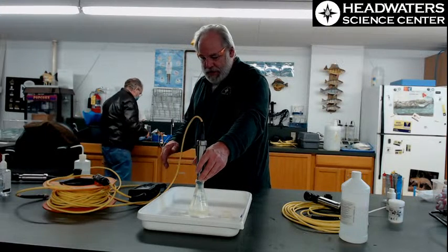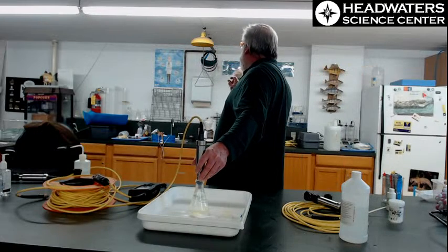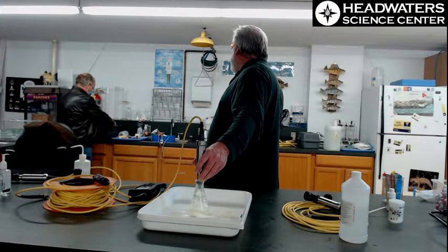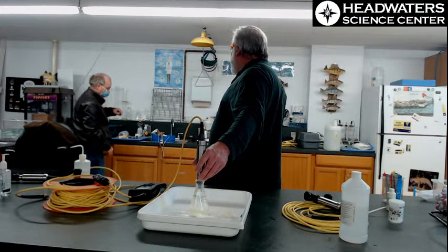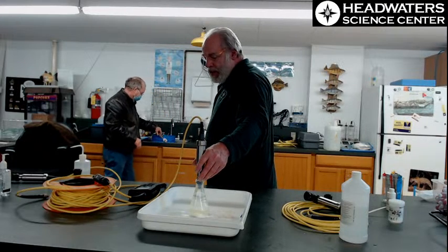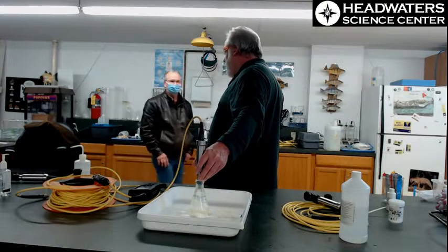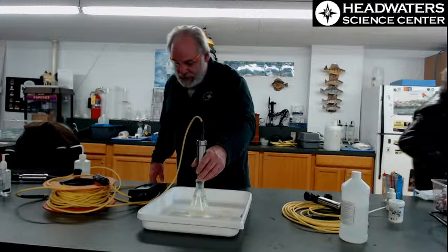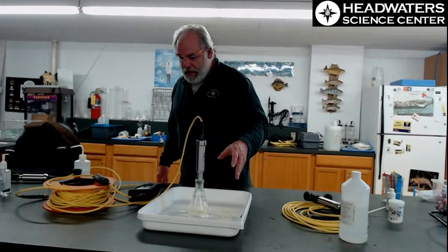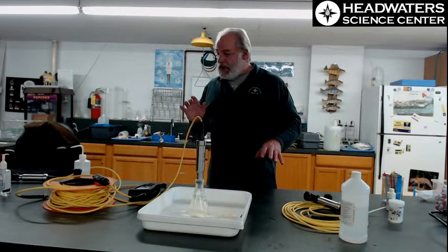Now this thing is really being stubborn about finding its calibration, so I've got more to say. We have to make sure that the sampler itself doesn't bring anything in. I clean up the box. Right now I'm soaking the rope. I make sure I don't introduce anything into the sample that isn't there naturally. And this is really not going towards the stabilized condition. I know it does sometimes take a while. I'm going to hold that like that. Sometimes if I just look away, it decides it wants to do what it wants to do. Let me see what else I'm going to talk to you about here today.